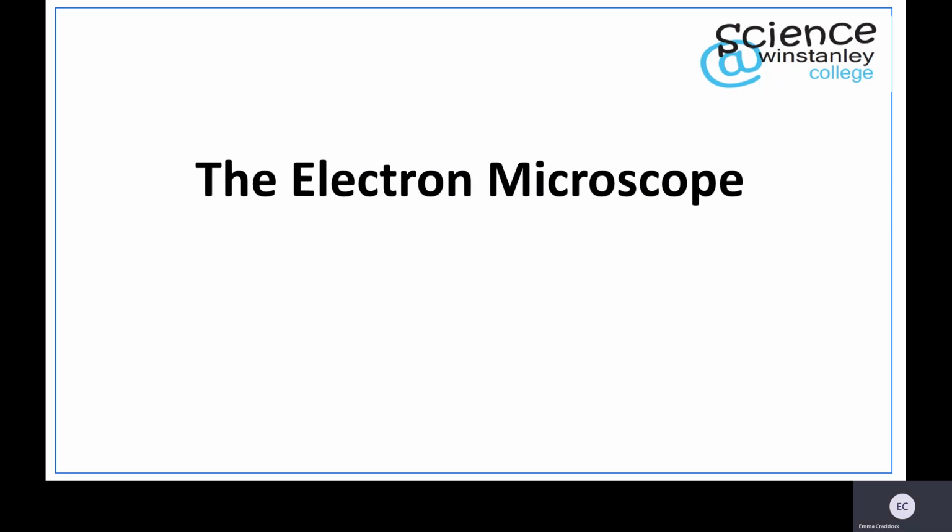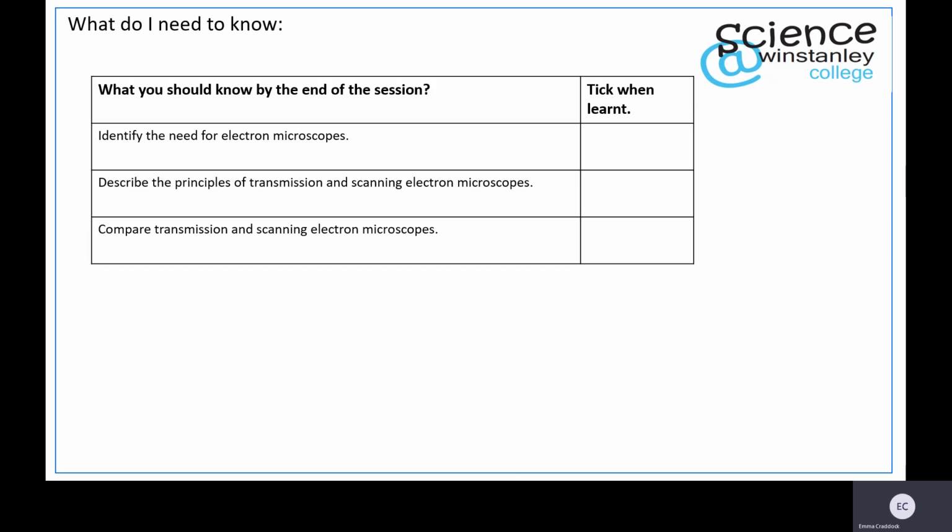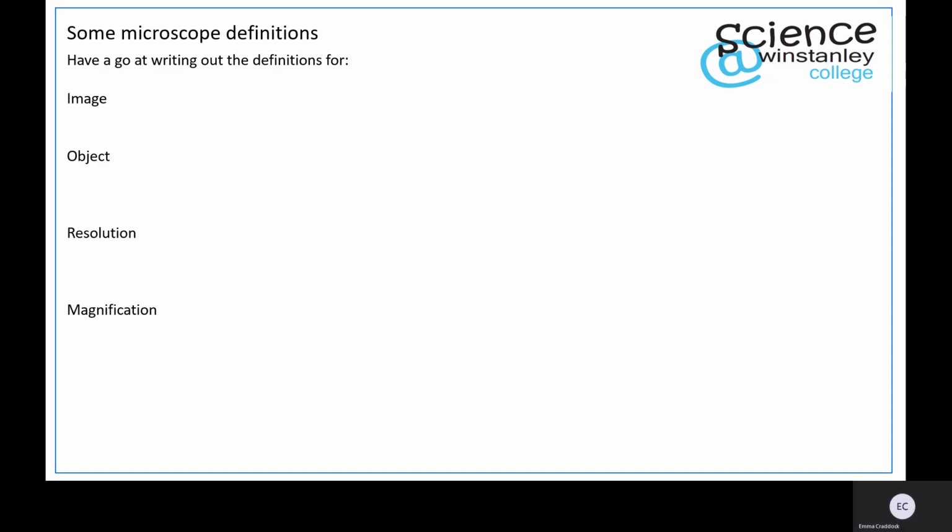In this video, we are going to learn about the electron microscope. By the end of this session, you should be able to identify the need for electron microscopes, describe the principles of transmission and scanning electron microscopes, and compare transmission and scanning electron microscopes.